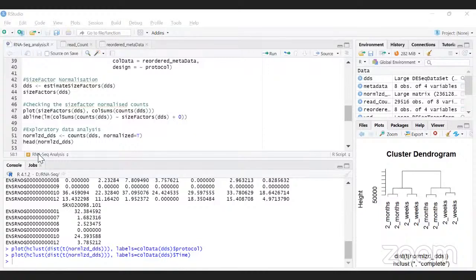So yeah, then you would want to, for example, in a normal state, for this particular gene this transcript is expressed, but in a tumor cell this particular transcript is expressed. But to do further downstream, you can probably look at a few of the networks, and you want to look at how these transcripts are behaving as a group. You could do that, but you cannot per se find out the pathways they are in.